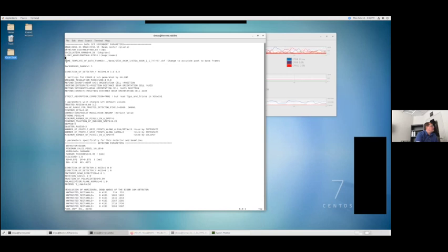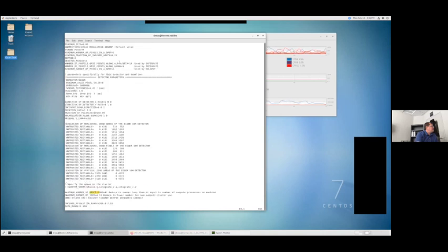So then once you change the name template of the data frames, you would want to go all the way to the bottom. And in this case, you want to look at these things starting with maximum number of processors. So when you get this from Rapid, it's going to have maximum number of processors equals 84, and then maximum number of jobs equals 8, okay?